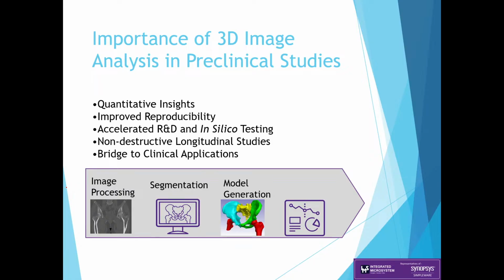Apart from this, considering the model generation, we don't have the analysis capability as of now in the software, but we have a good integration between a range of different tools. So what we can do is create an FE model directly in Simpleware, which can be further simulated in ANSYS software.